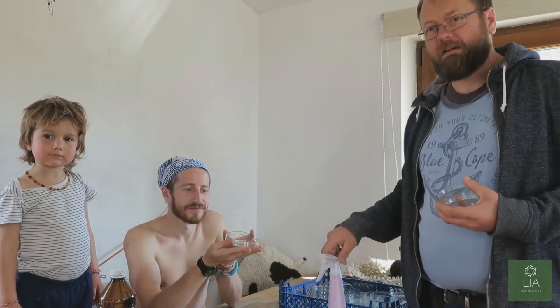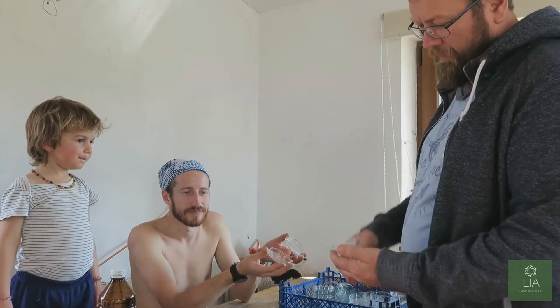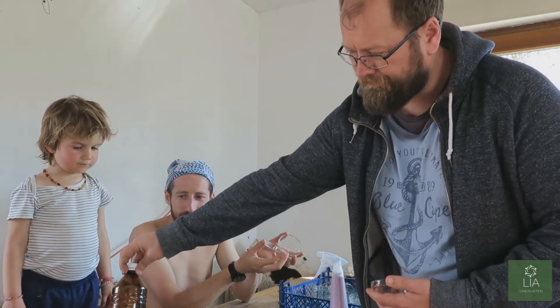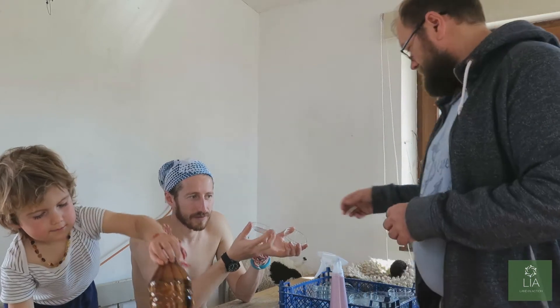So here we are, we're about to prepare the Petri dishes. What we're doing is giving each Petri dish — the lid and the base — a slight spray with alcohol. This is 95% ethanol. This will just make sure that there are no contaminations in there.